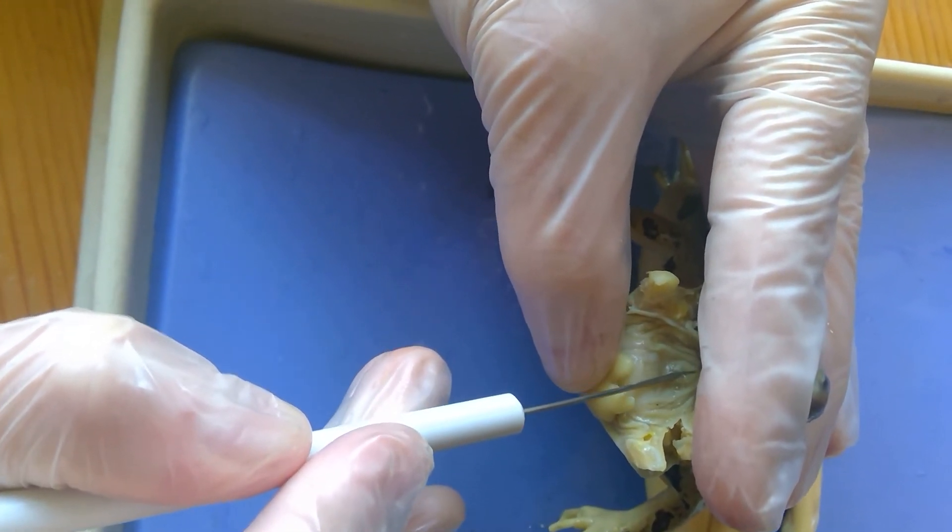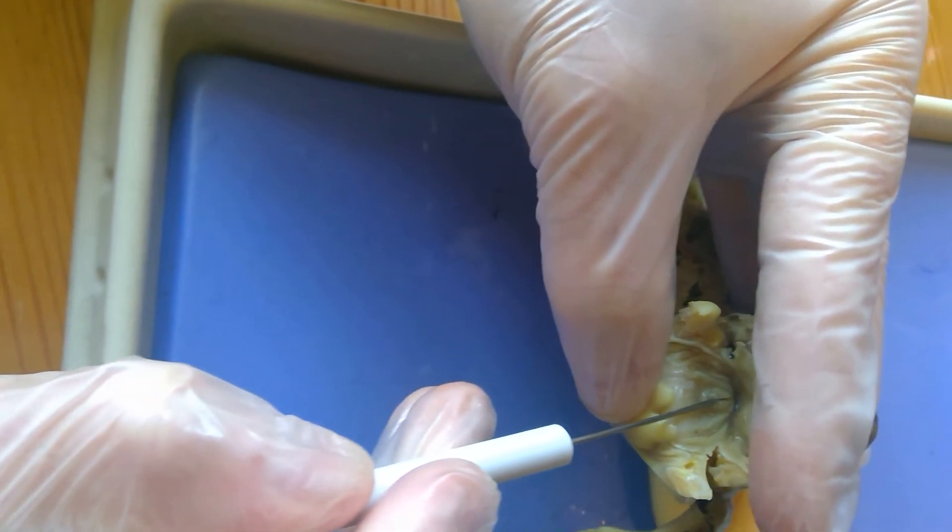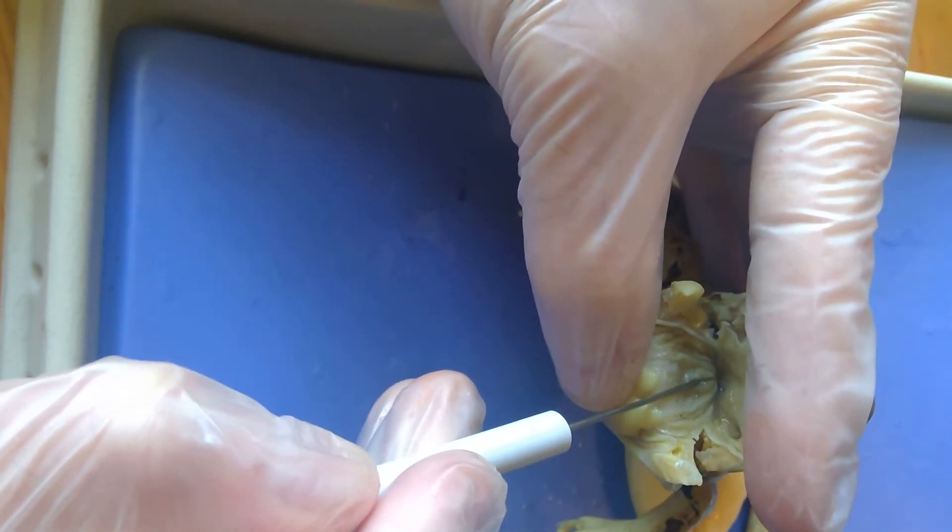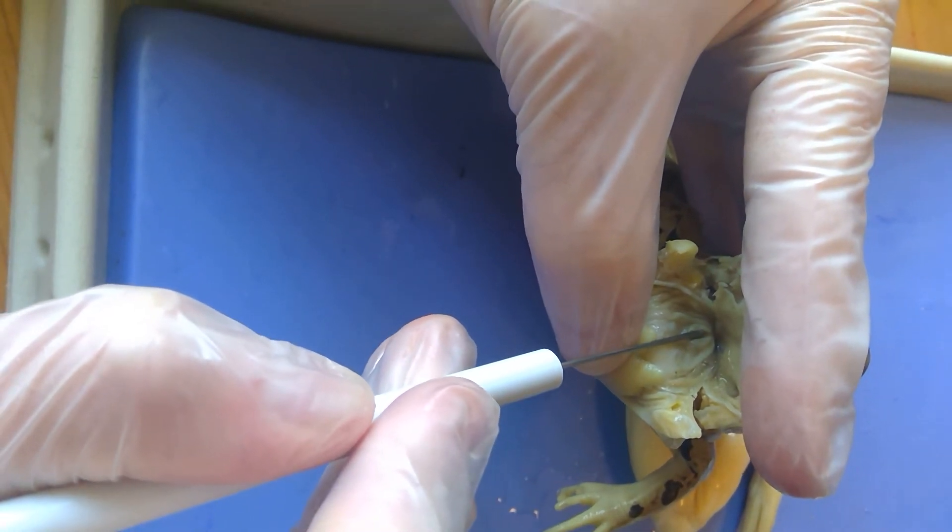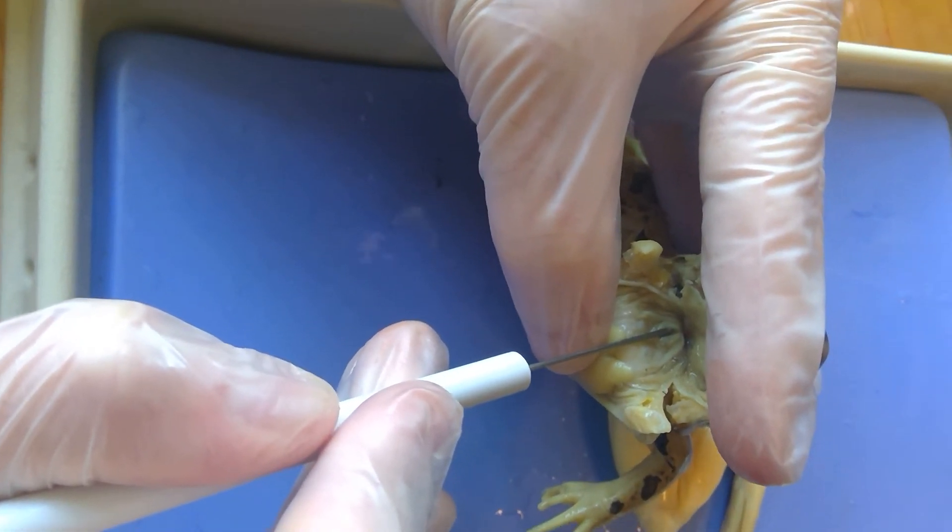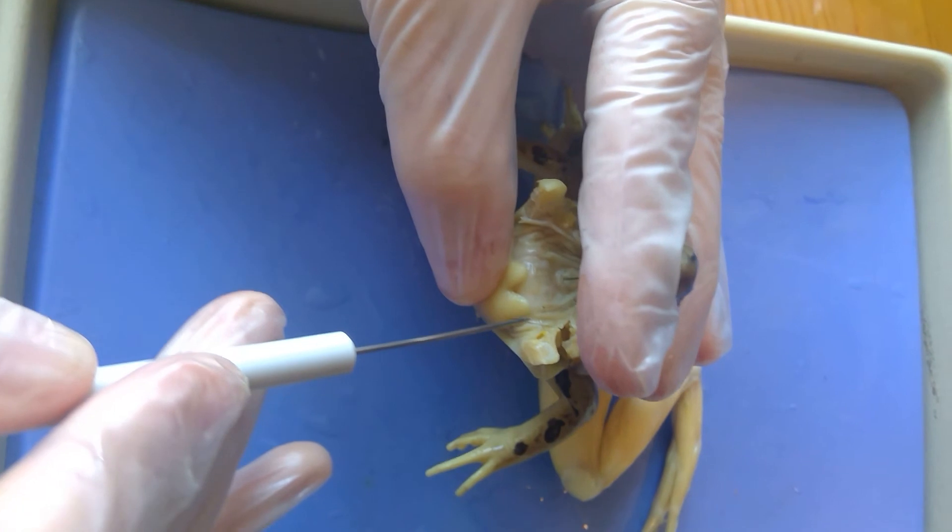So, that hole right there. So this hole right here is going to be called the glottis. And what you see is it has an open little slit right there to open up. And then it normally stays shut.